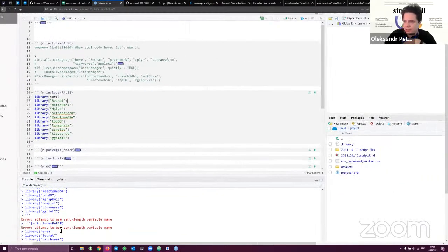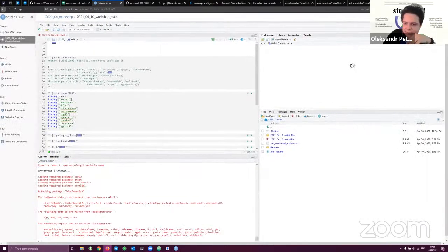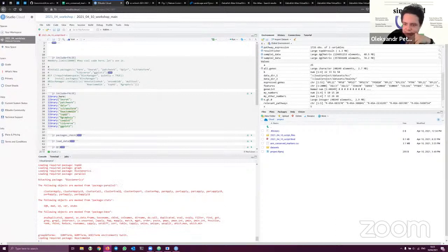Yes. Can you hear me? Yes. I don't know what I'm doing, but I seem to not be able to use the notebook. I mean, I can use it in the sense that I write things and it doesn't do anything. Could you share a screen for a second? Maybe we'll take a look. It's also possible that the console, which is the panel below, just hides when you execute something, and you just need to press it again, and it will appear.